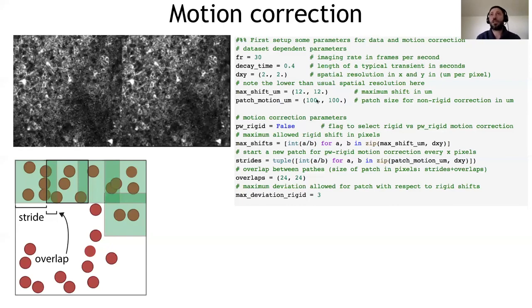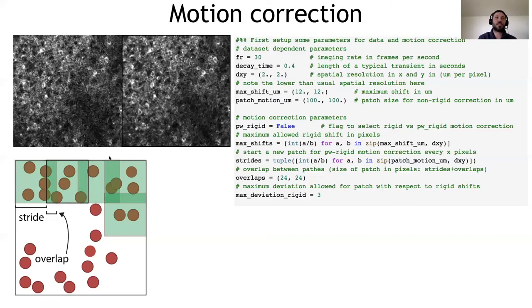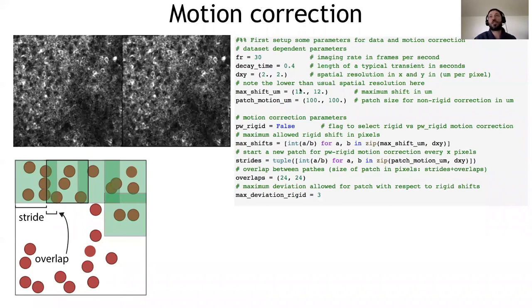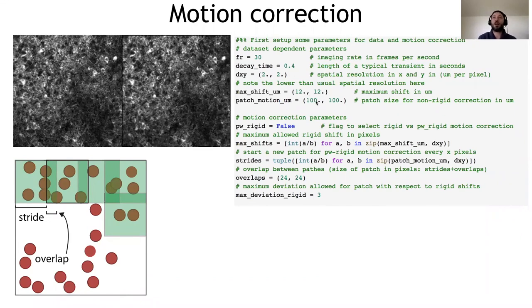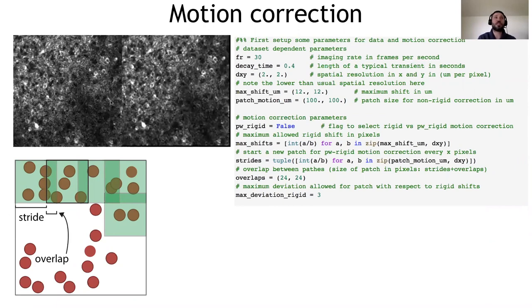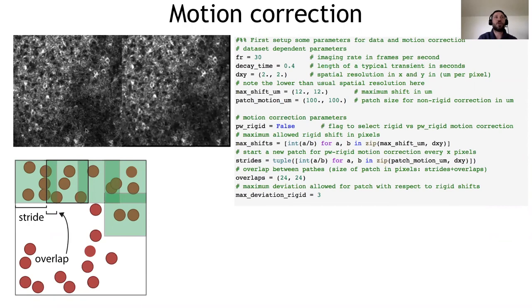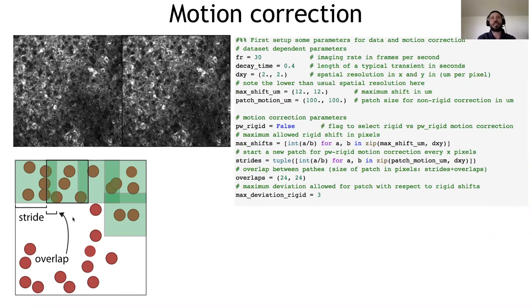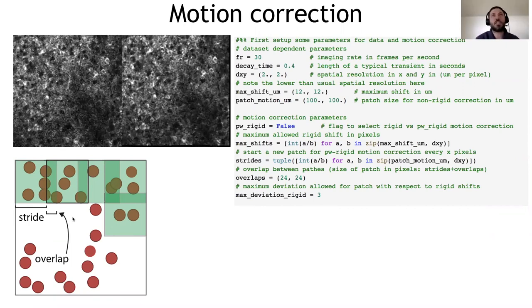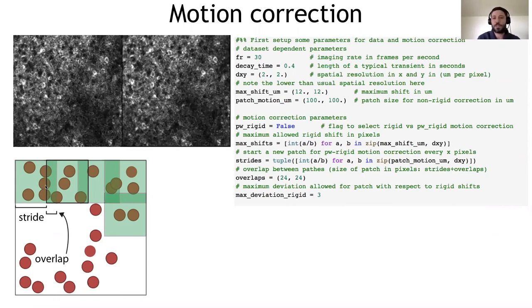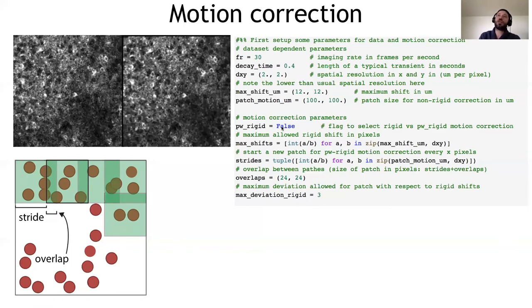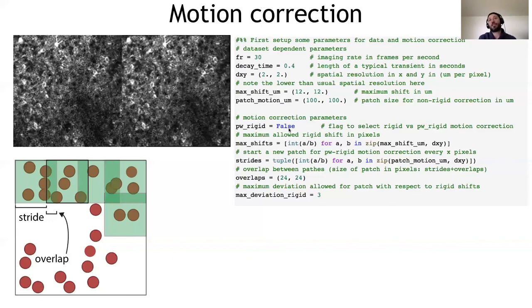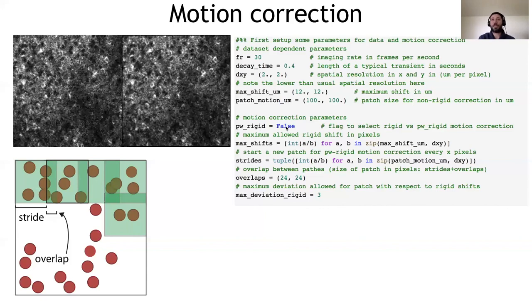And finally, we have the patch size. So when we divide the field of view in these patches, we want to know roughly what is their dimension. In our experience, in general, it's not necessary to change these coordinates. But of course, if you see, for instance, that there is an area that is very dark and there is not much structure that can be used to motion correct, then you want to increase this. And in this case, you have a trade-off between how elastic, how non-rigid is your motion and how big are these patches. You can, of course, choose to use motion correction rigid or non-rigid.